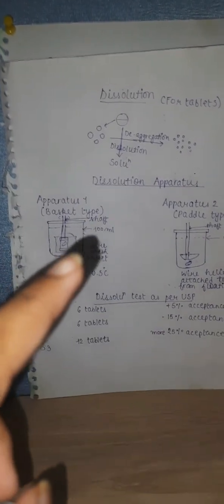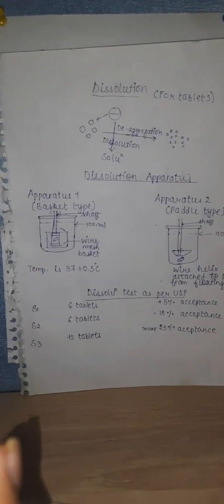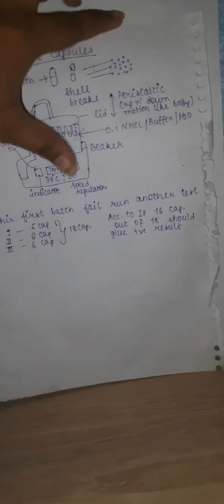So now we are done with the dissolution test for the tablets. Now we'll discuss the capsules.